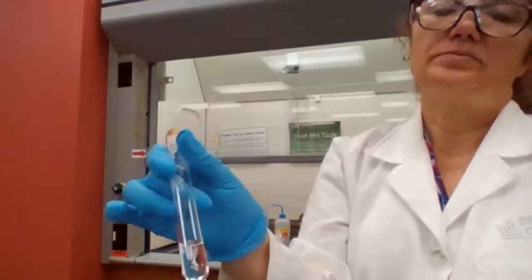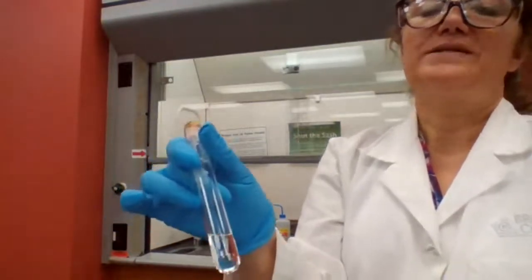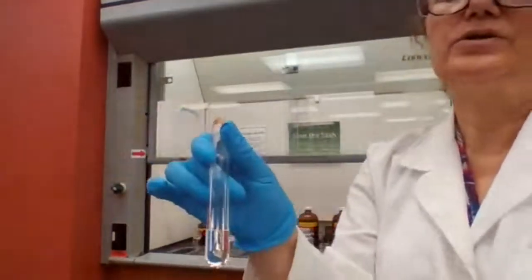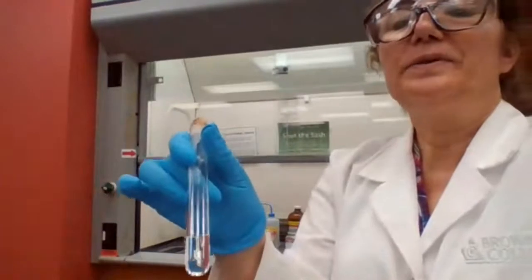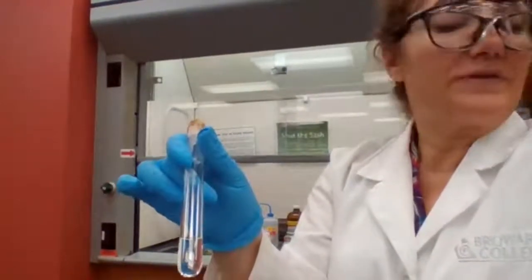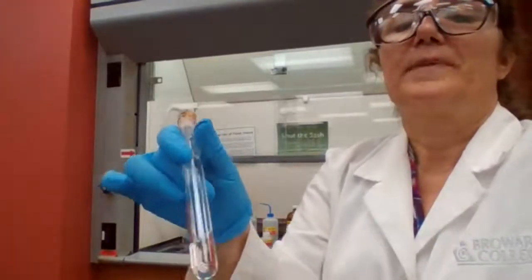Silver nitrate test. Tell me what to do. If I'm too fast, you tell me what to do, and then I'm going to follow your procedure. Okay. Add 2 milliliters of silver nitrate. Okay. And mix it.